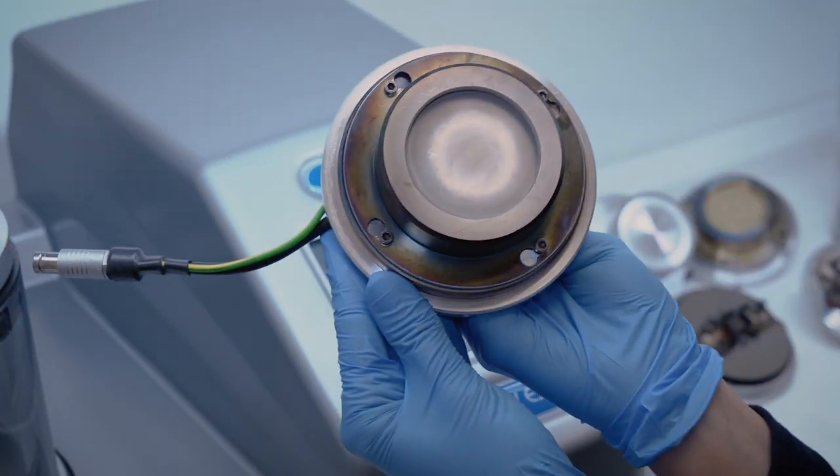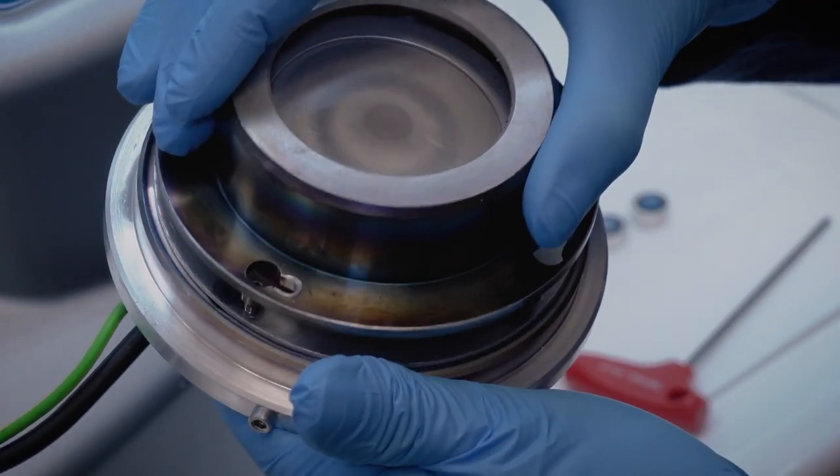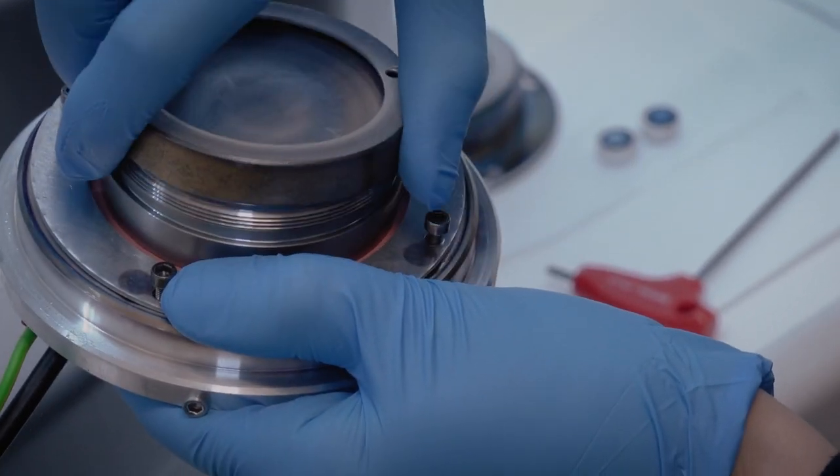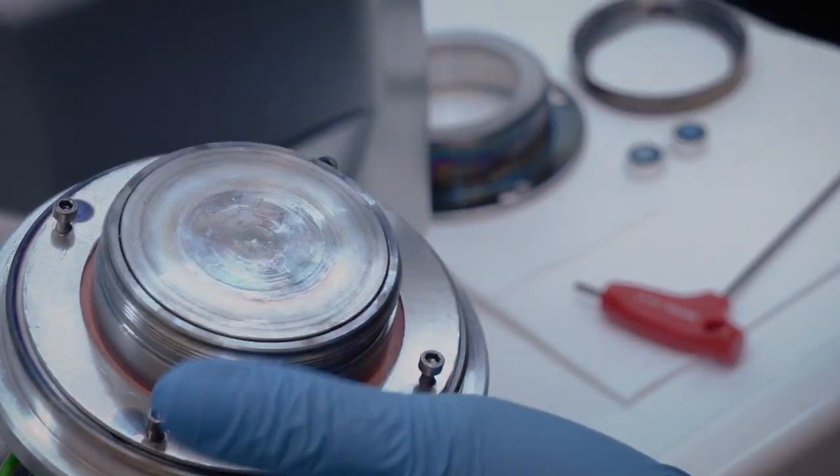To remove the target from the head, four locking screws must be removed to take off the top shield. Under the top shield, there is a holder that needs to be unscrewed to access the target disk and replace it.